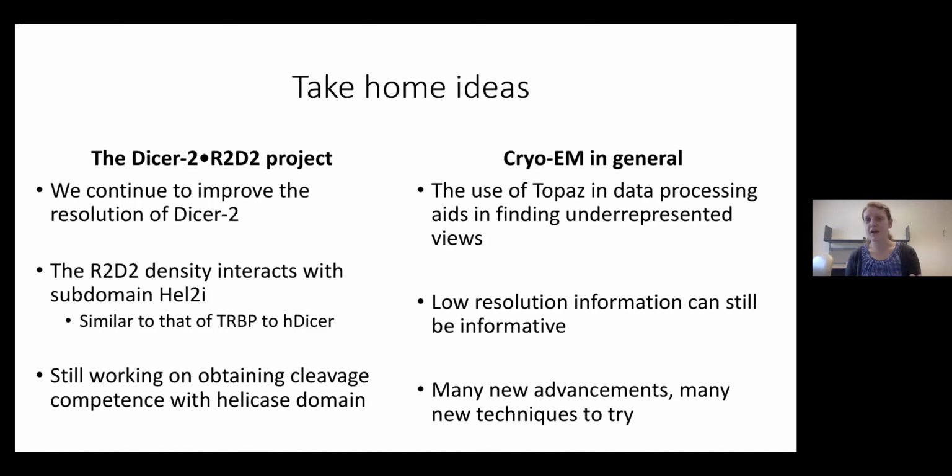And finally, if you're not an RNA biologist or someone that studies RNA interference, I wanted to give you some take-home ideas in general of what you can take away from my talk and potentially apply to your own projects. The first is the use of Topaz. You saw that I spent many slides focusing on Topaz and how I was able to help my project find underrepresented views that were present in my data set, but just not being found by traditional methods.